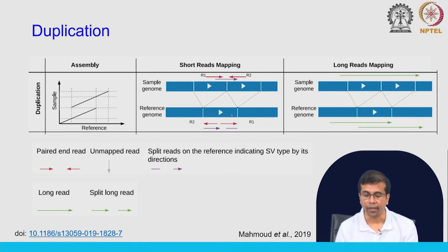Okay. And then again we have these reads, if they are coming across this breakpoint, this one in violet color, this will show split mapping in case of the reference genome. When you are mapping the data against the reference genome, we will see this kind of split mapping. For long reads, we will see this kind of overlap in the mapping, right, because one region has been sequenced twice. This was one region in the reference.